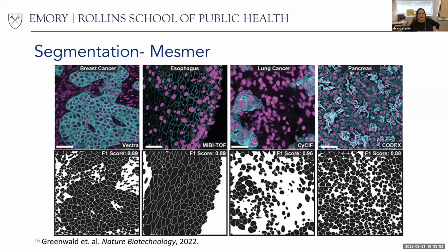Yeah, that's another thing I think needs to be emphasized: you need a lot of manually segmented images, and you also have to worry about the rater agreement, and that's a whole separate analysis that needs to be incorporated. So I think there's a lot of issues with that, and I just wanted to mention that.